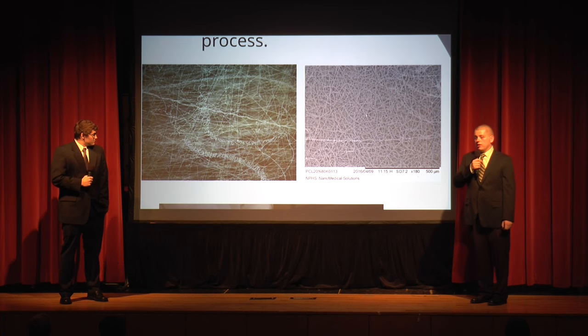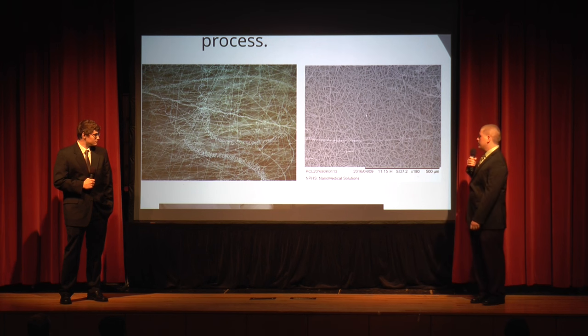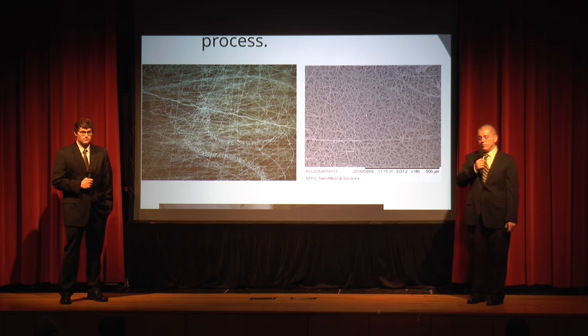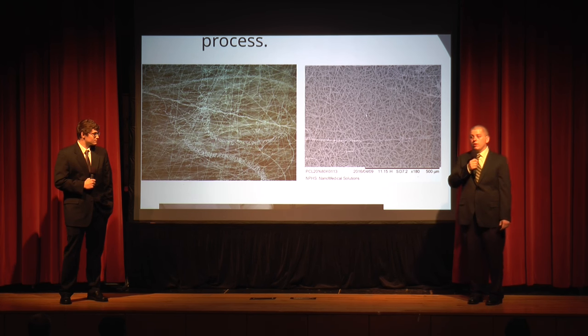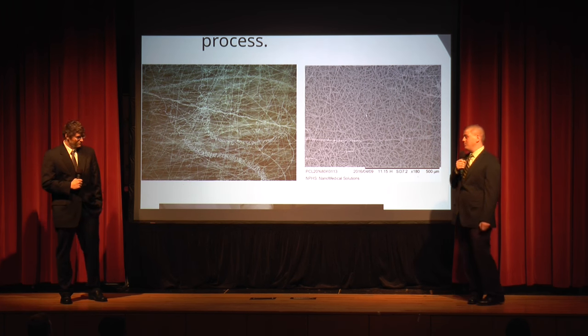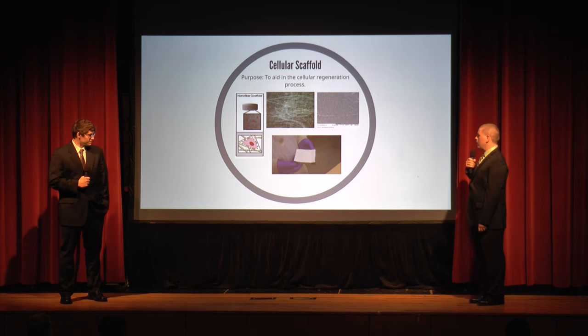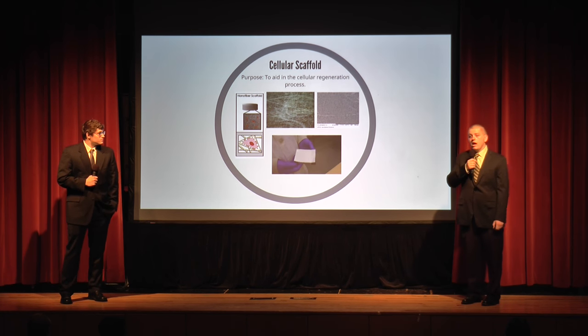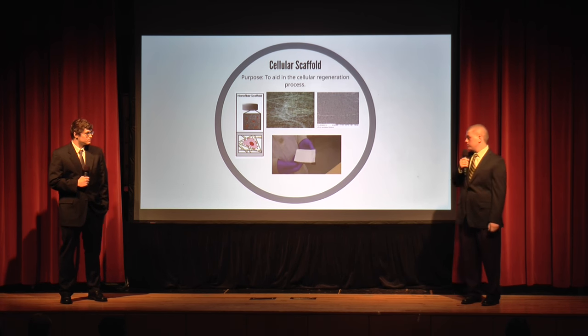The Zeiss optical image on the left allowed us to visualize our PCL nanofibers. The SEM image on the right allowed us to quantify our PCL nanofibers. PCL, also known as polycaprolactone, is biodegradable and promotes a healthy and successful cellular scaffold. The image at the bottom of the screen shows our PCL cellular scaffold after the electrospinning process.